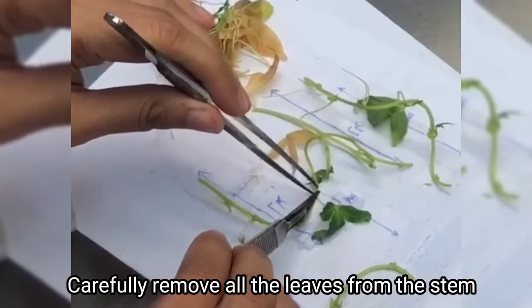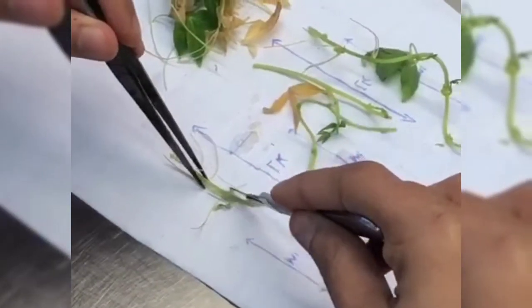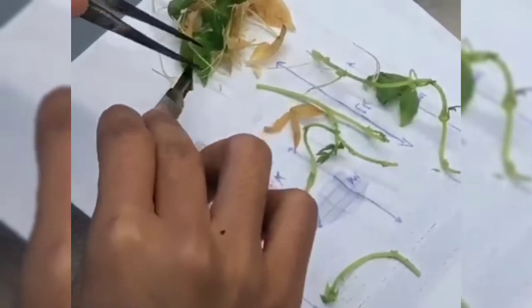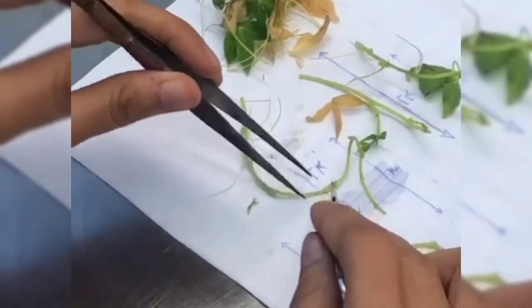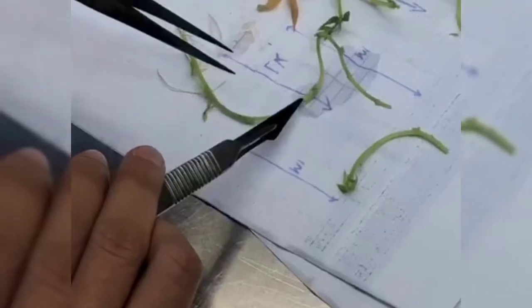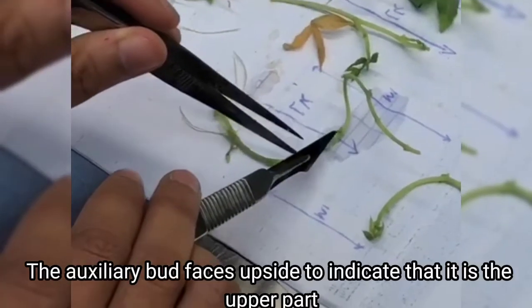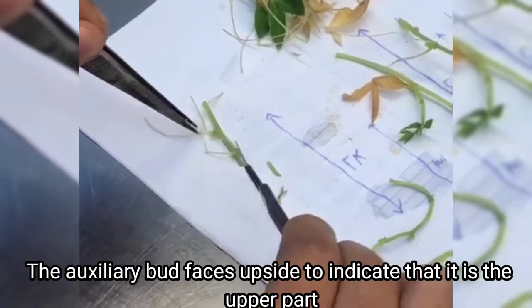You also need to remove all of the leaves from the stem — do that carefully. It is important you identify which part is the lower part and which part is the upper part so you can cut it appropriately. Note that the axillary bud faces upward to indicate that it is the upper part.